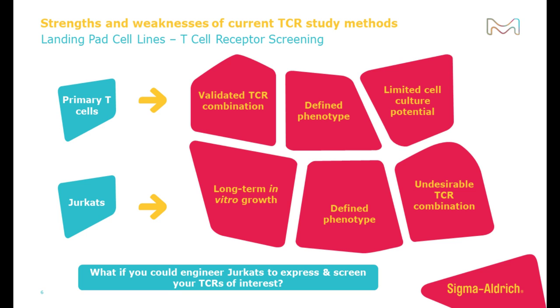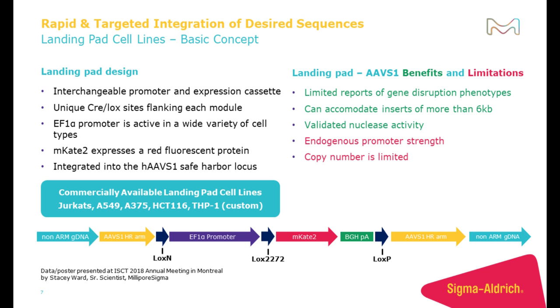So what if you could then engineer those Jurkats to express the specific TCR of interest rather than the melange of TCRs that you might get in a standard Jurkat line? This is the question that we asked ourselves as we decided to engineer some of these landing pad lines.